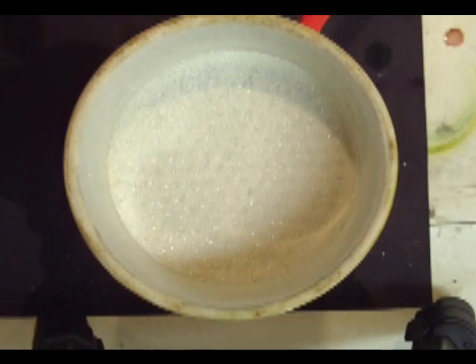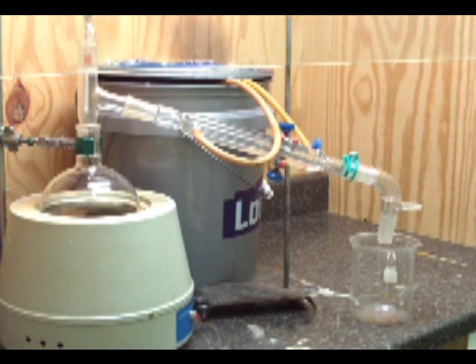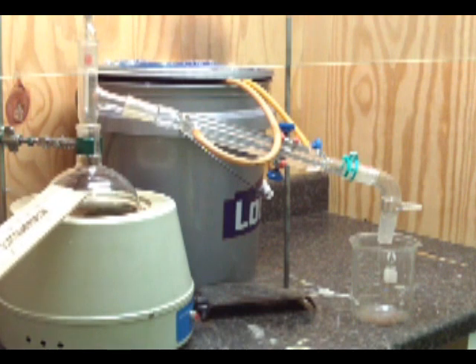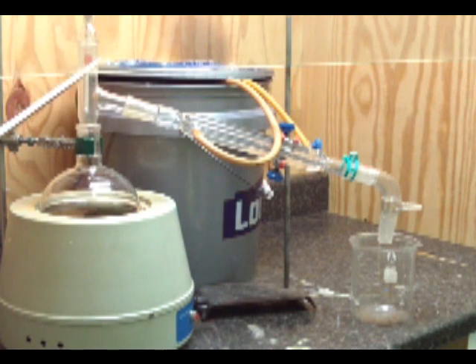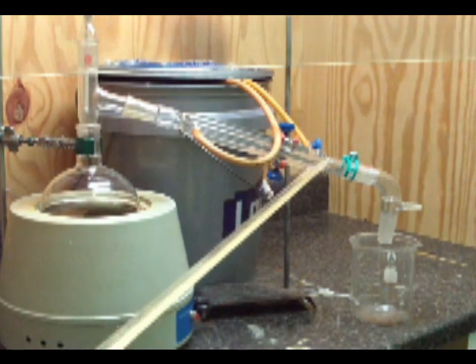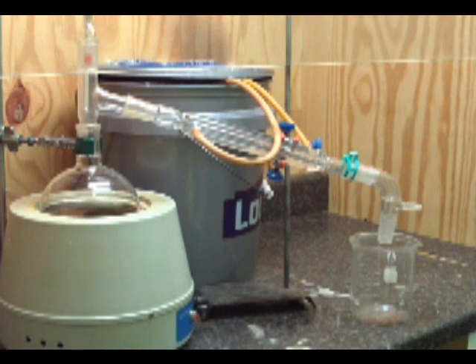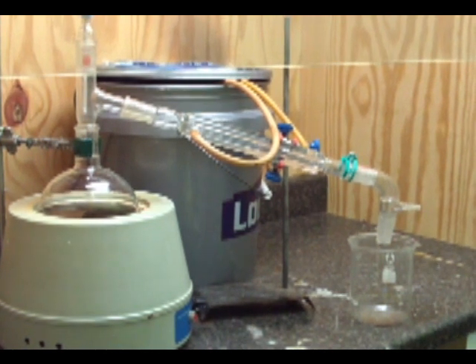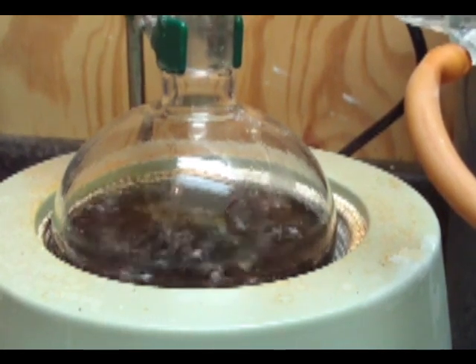Now we need to set up a simple distillation. Take the filter flask and pour it into a one liter round bottom flask and set up similar to this. I use a plastic container to save my water — just a little pump in there and a whole bunch of ice. This is just a simple distillation. When you first start the boil, water comes over first, and in the first distillation there's going to be a lot of water.